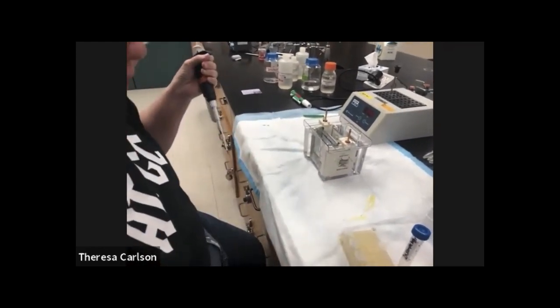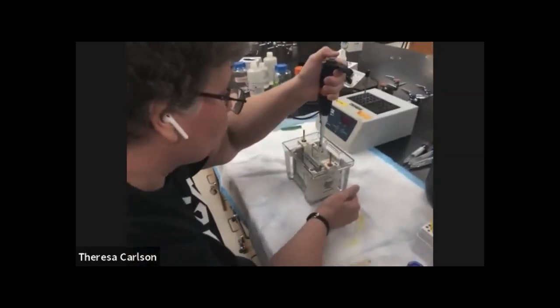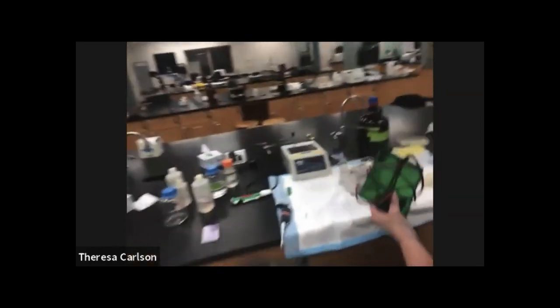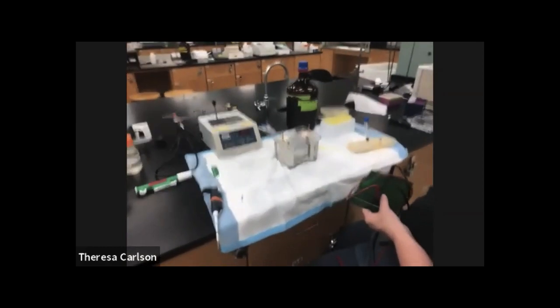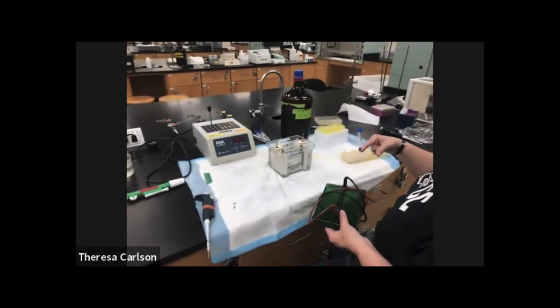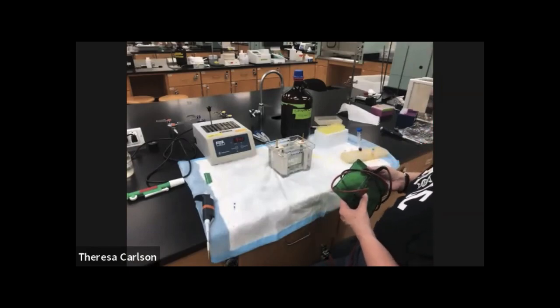You can look it up and the data will tell you there are 4 subunits in aldolase, but how do you figure that out really? One of the ways you're going to do that is you're going to compare the size of a single subunit with the molecular weight that you get off of your sizing column. The total native molecular weight from the sizing column divided by the size of a single subunit will tell you how many subunits there are in aldolase.